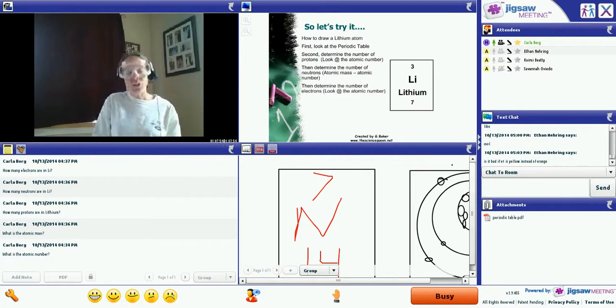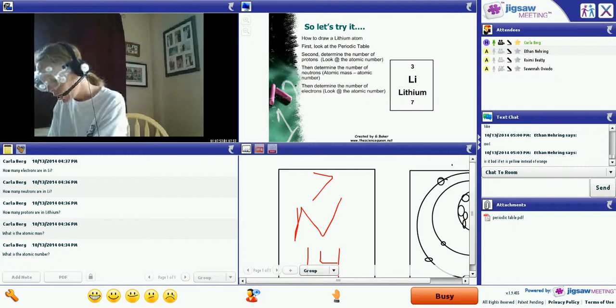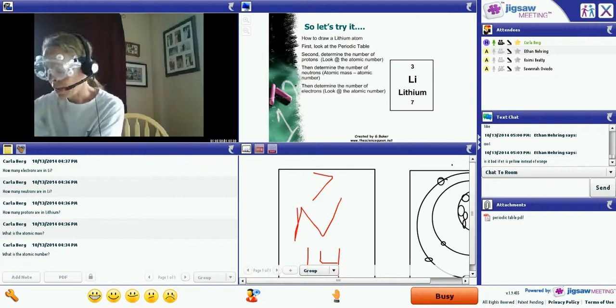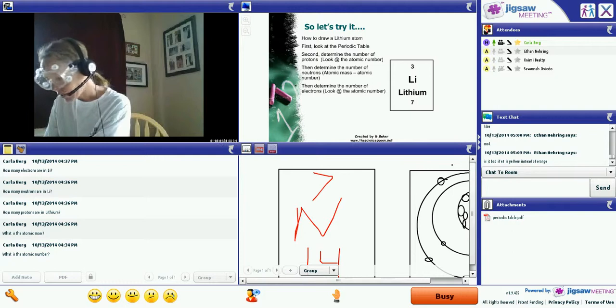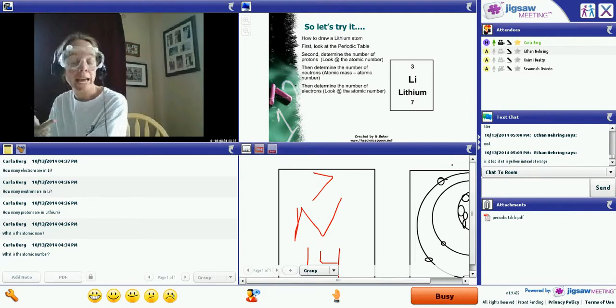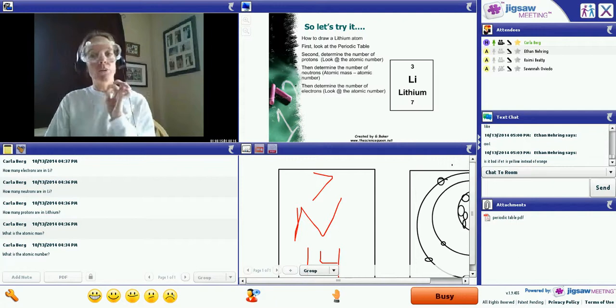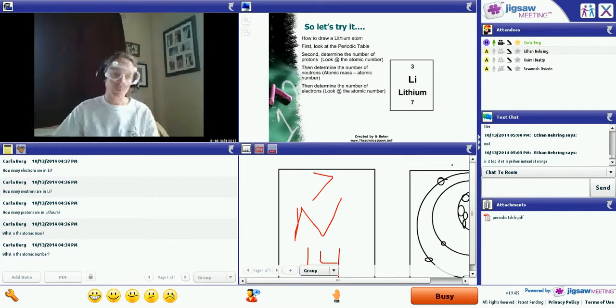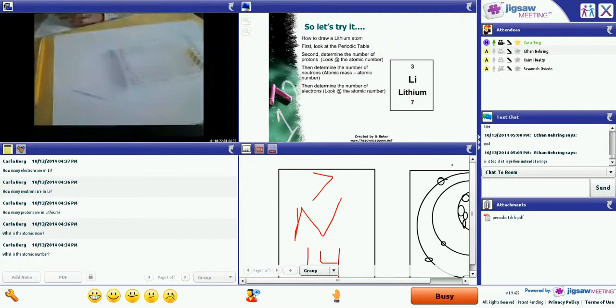What I would love for you guys to do is go ahead and do the steps to part B of this lab until you get down to step 10. So you're going to do 8, 9, and 10. I'm going to put my camera so you can see me doing the lab. Make sure that you shake your bottles. Okay? So go ahead and do steps 8, 9, and 10, please.